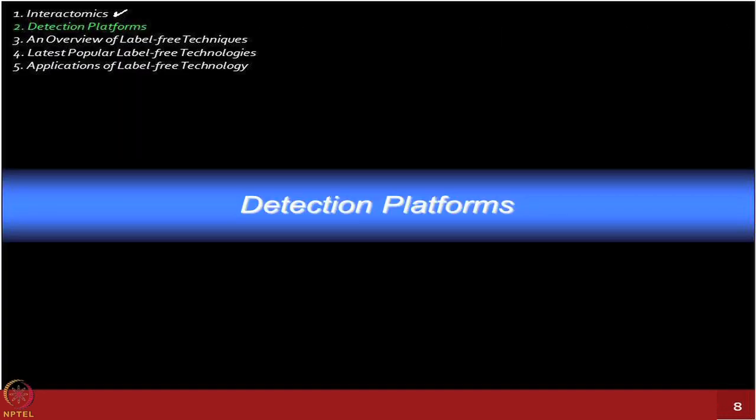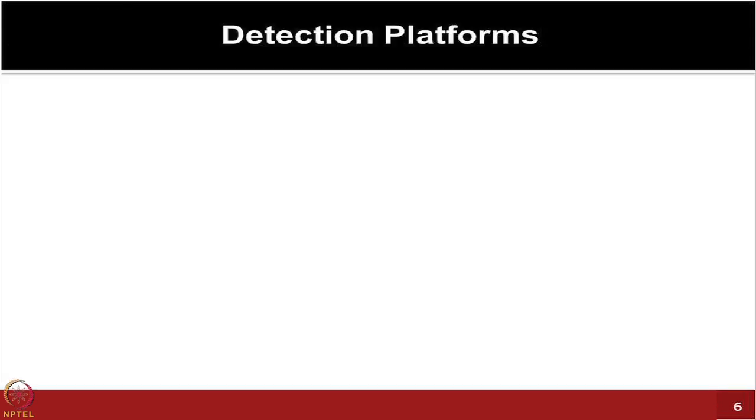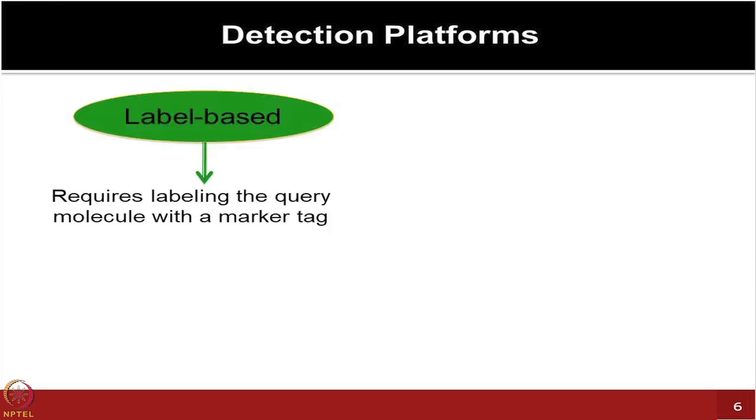So, let us talk about detection platforms and their comparisons. You want to detect the signal after doing the assay, right, and that is where, whatever you have hypothesized, at the end only by looking at the dots or looking at the curve, you know whether your experiment has worked or not. Therefore, you need to have some robust detection platforms, and to do that you are either using some sort of label to follow your experiment, and then you are trying to measure those labels either with fluorescence based methods or chemiluminescence based methods. Sometimes even radioactivity based assays can be very powerful.